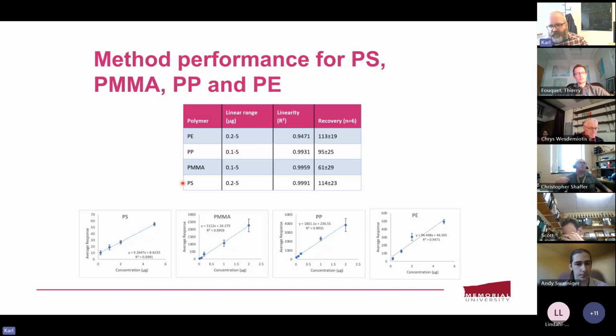We put it in an accelerated solvent extraction cell, extract it, take the solution, concentrate it to about 200 microliters, and then we transfer about 10 microliters to the pyrolysis cup. So they're not being treated exactly the same, and that could be where some of this could be an issue. We just have to try.